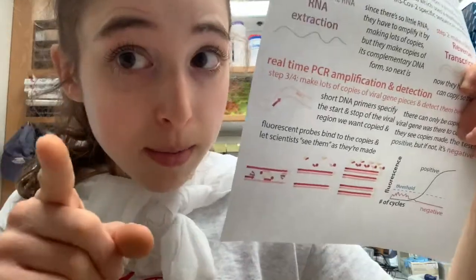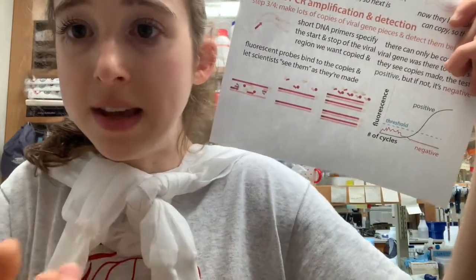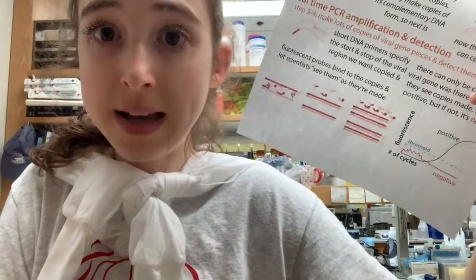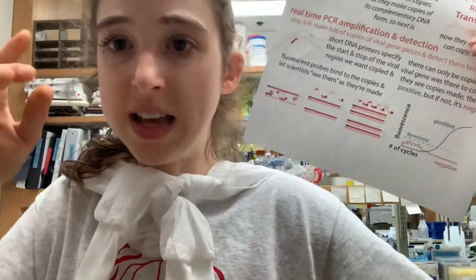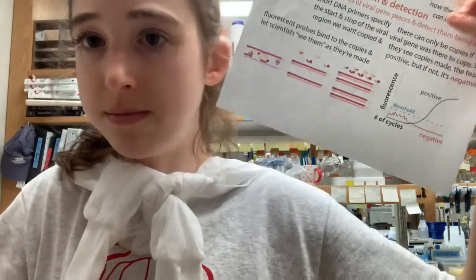So now we're getting a ton of this viral DNA, but only if it's present. If the person's not infected, that viral sequence isn't going to be in the sample that you take, and so you're not going to get anything amplified beyond a baseline of noise, just artifacts, nothing.